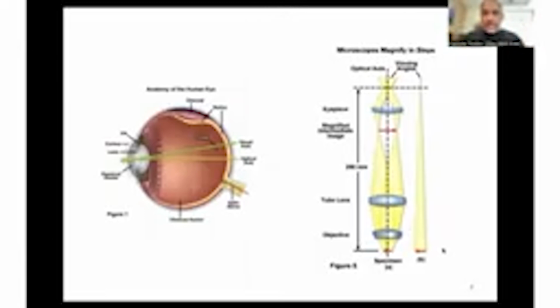And there are, of course, classic examples of how light is used to perceive objects. The fact that you're looking at a screen and are able to see what's happening is driven by the eye and how it is able to observe light and focus it and allow you to see things, right?